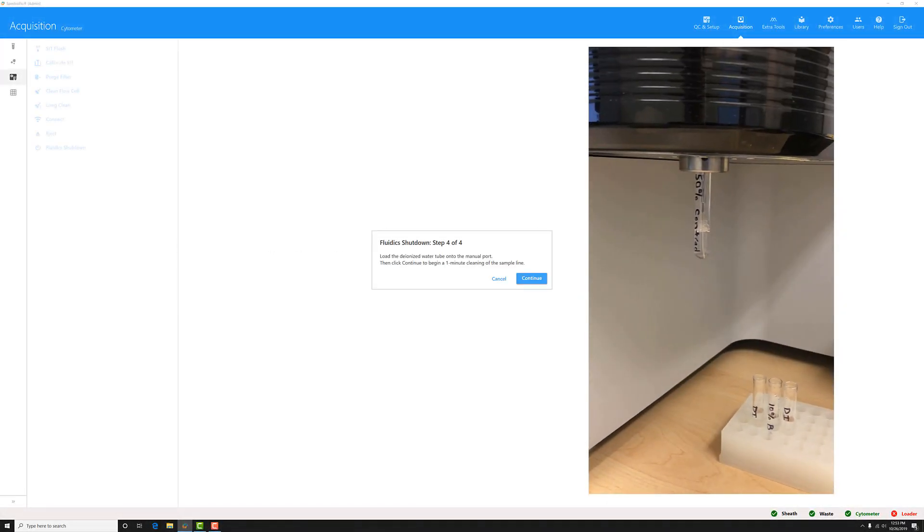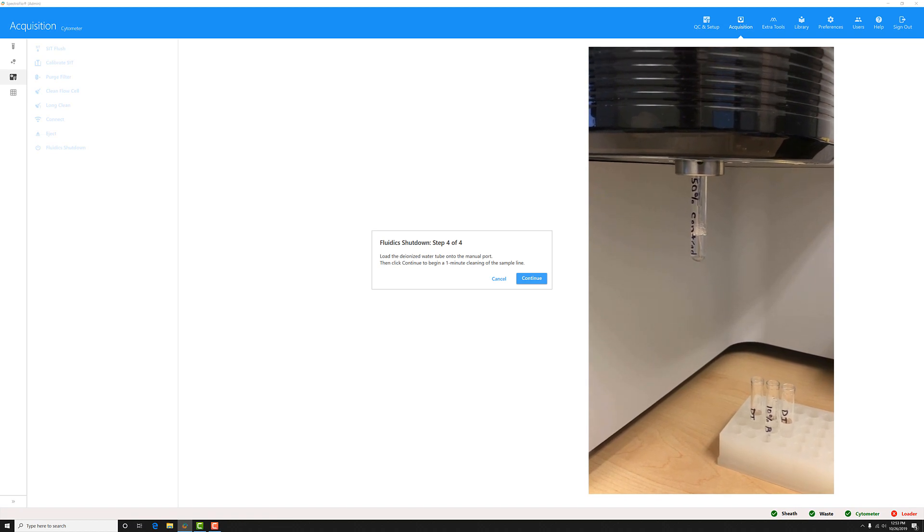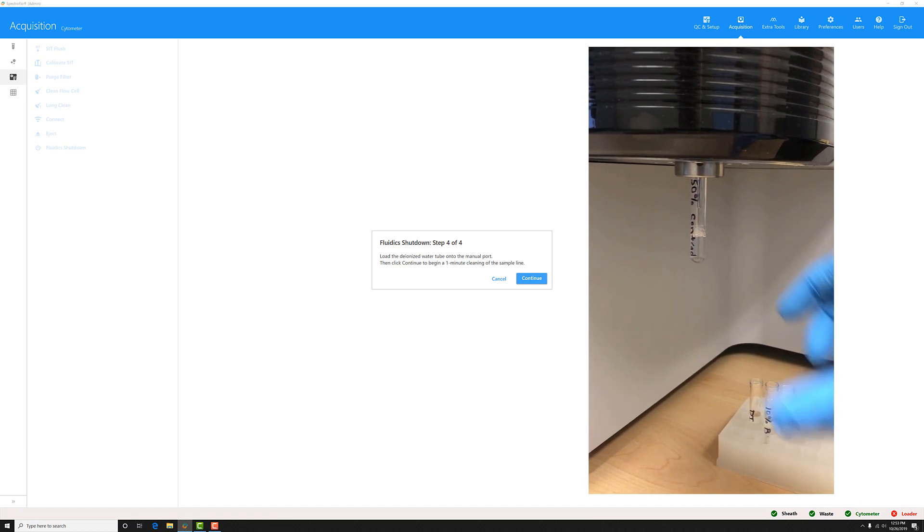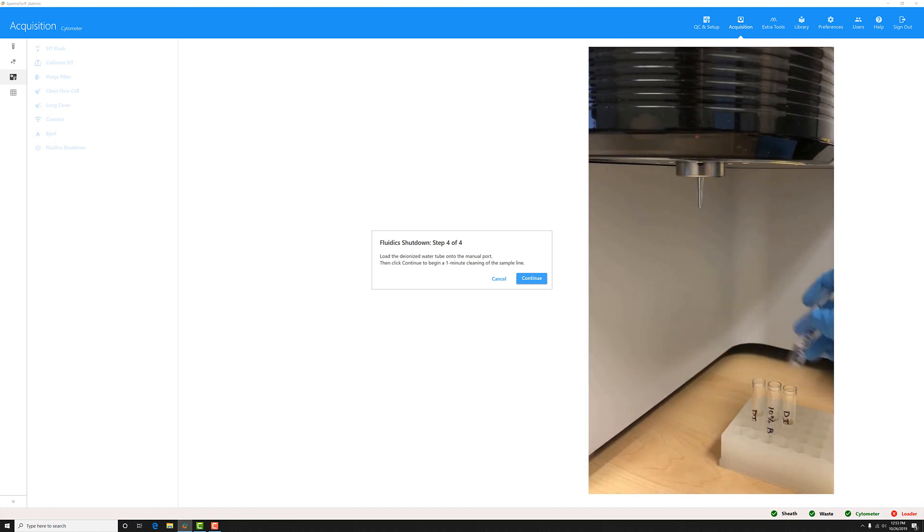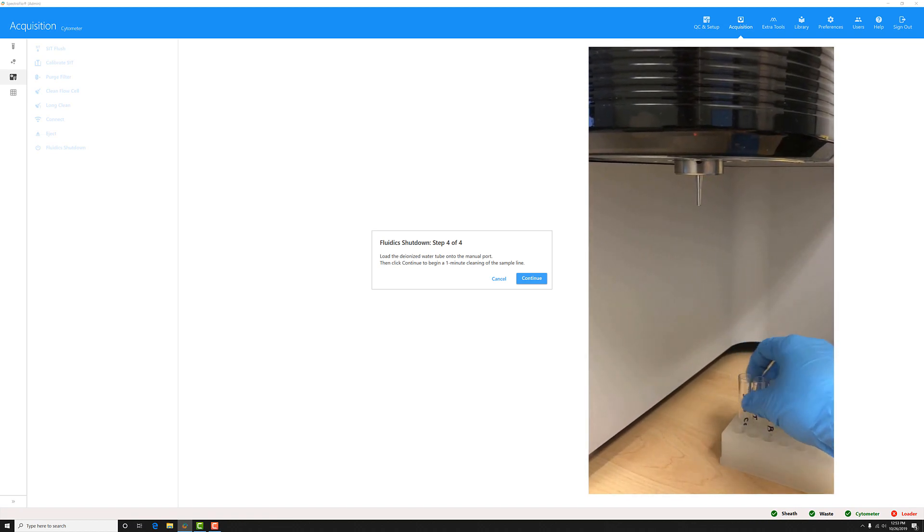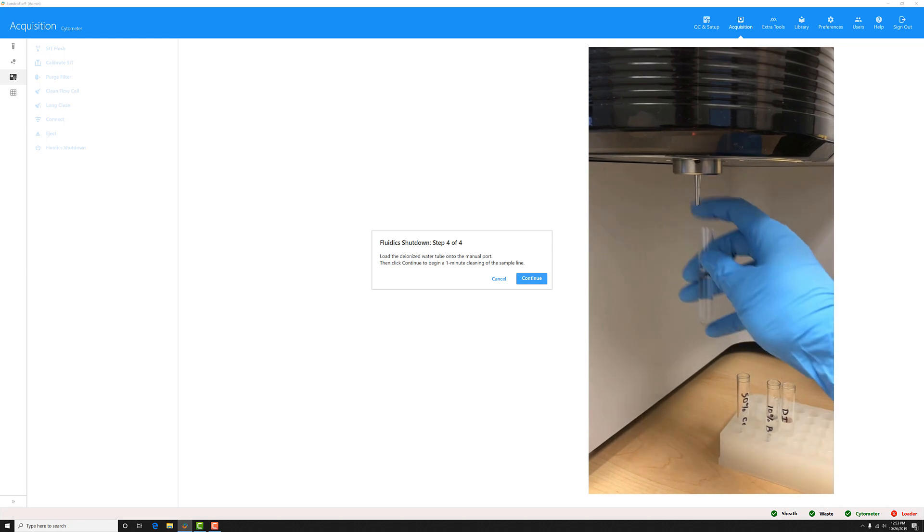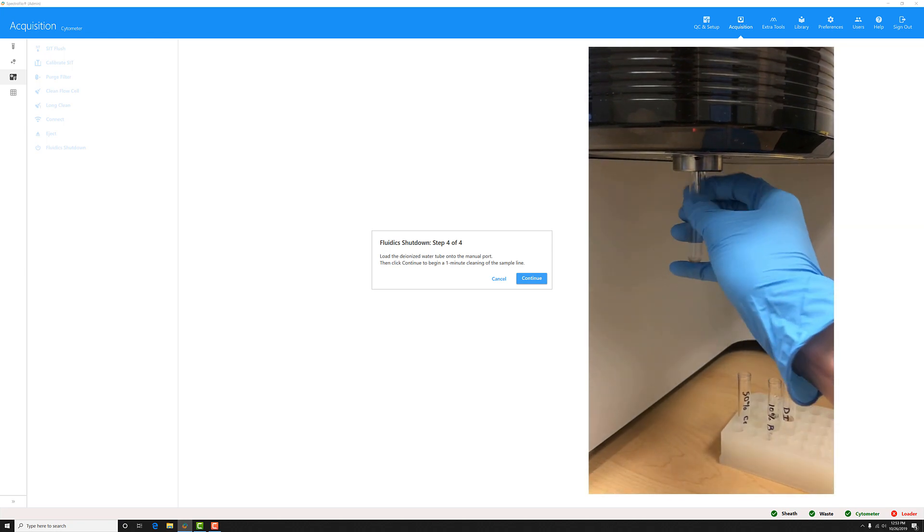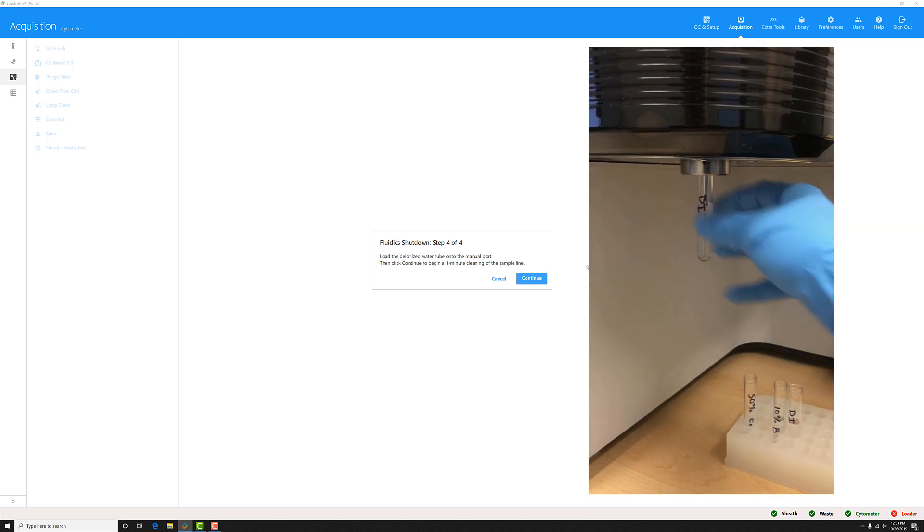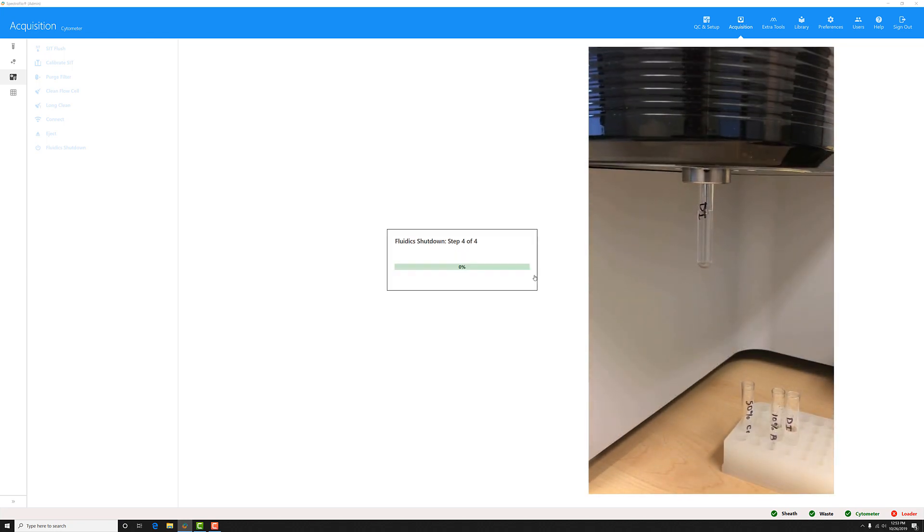When the third tube is complete, go ahead and unload it from the cytometer and load the last tube, which is a tube of DI water, and click continue.